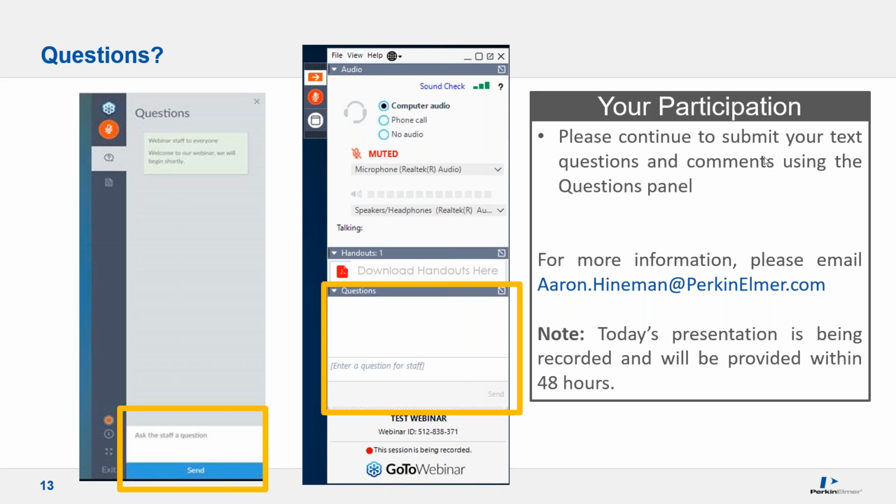Yeah, it makes life easier. It saves a lot of time for sure, if you can correct for it in that manner. Versus IEC, where you have to run that element and look at that element regularly.